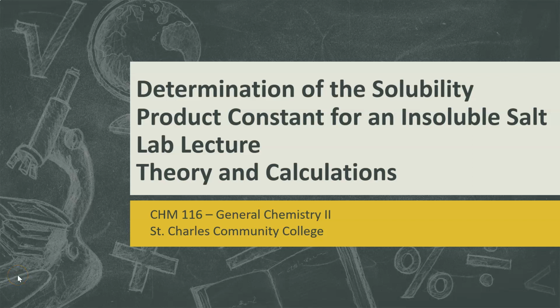This is the lab lecture video for the theory and calculations for the determination of the solubility product constant for an insoluble salt. This one I think wins with the most words in the title. So before we go through the calculations that go with the lab, we're going to talk through the instrument that is used to make the measurements in this lab.